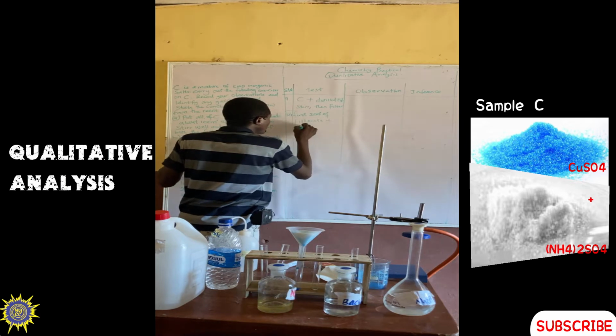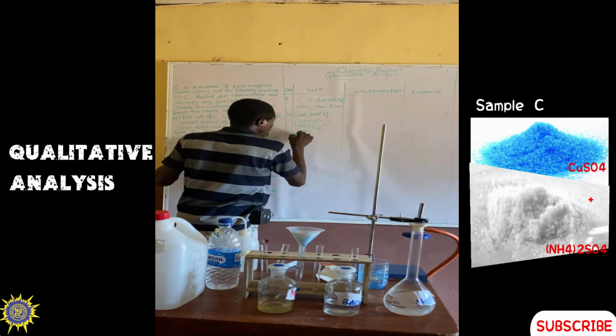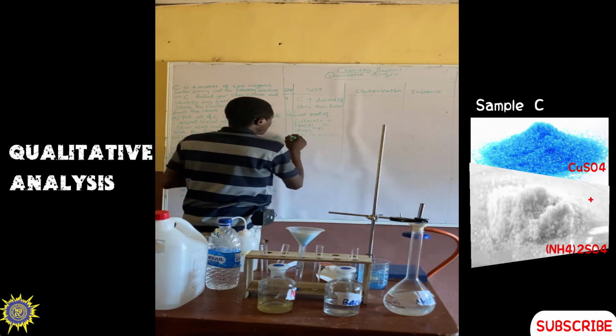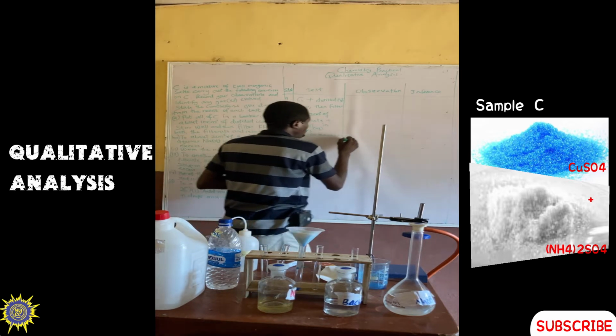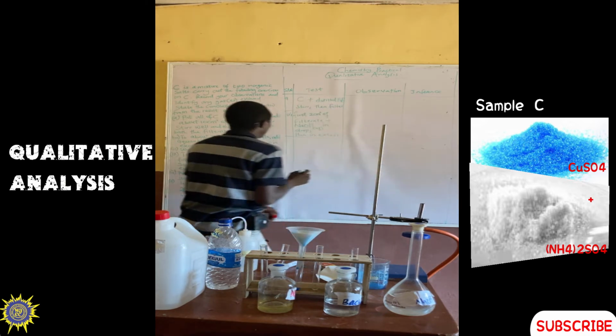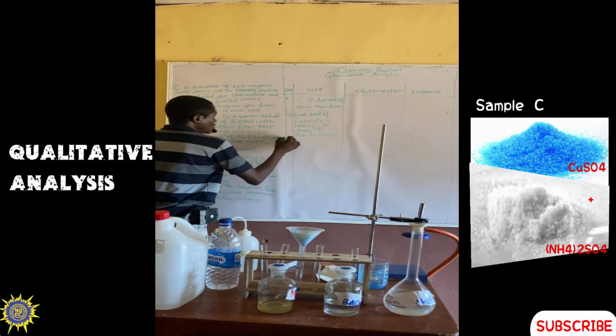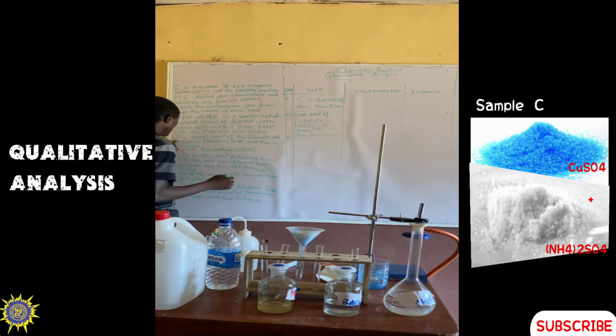Plus sodium hydroxide, in drops, then in excess. So what do we have? That is the first question under B, Roman figure 1B. So now we have what? Roman figure 2 under B.